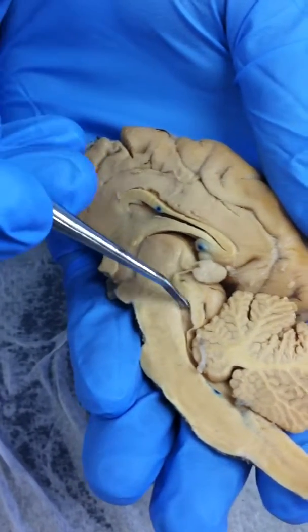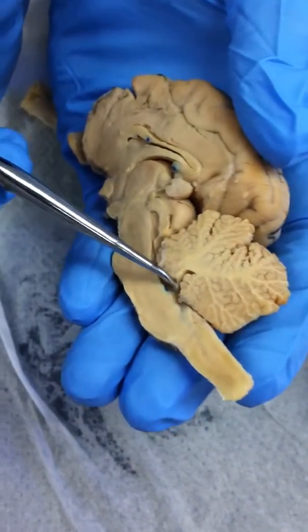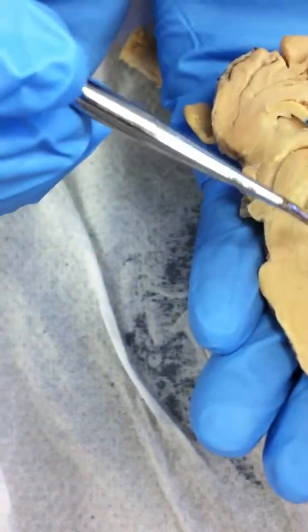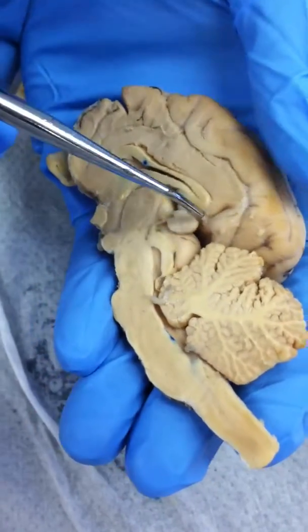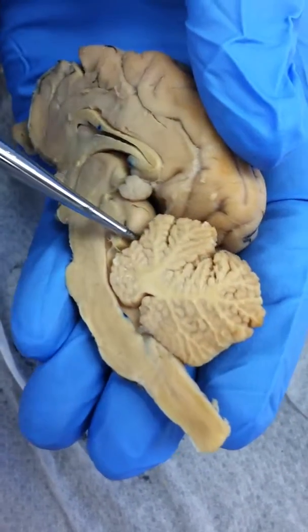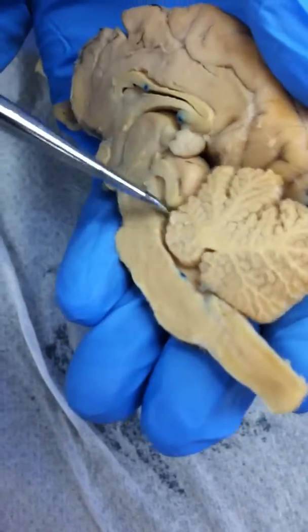And then we have the fourth ventricle. The fourth ventricle is right underneath the cerebellum, the space right underneath. So that's all this, not this, right? Just this under. This is called the cerebral aqueduct. The whole thing, this whole space up to the fourth ventricle. Cerebral aqueduct, right?